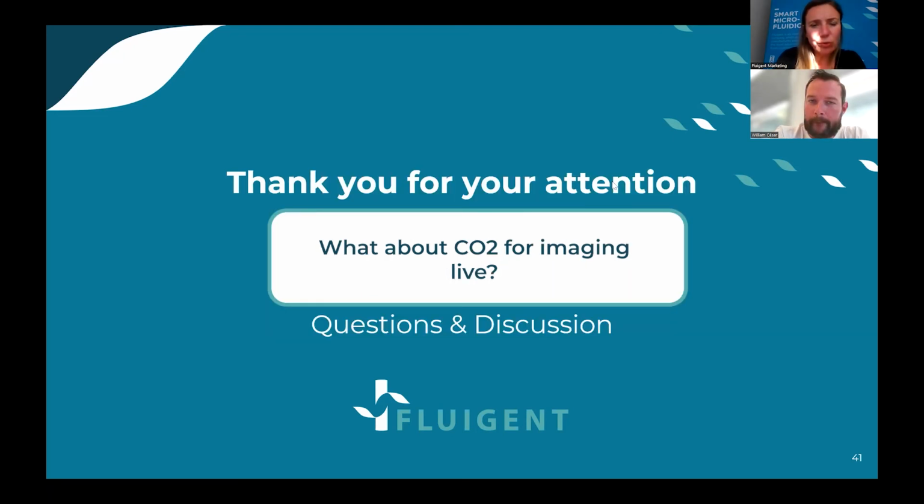What about CO2 for imaging live? William? Well, about the application, I don't know it. I cannot really. Yeah, well, I can maybe answer. If it is about mixing CO2 inside the solution, it is possible, as ARIA has a pressure input where you basically have to inject gas, and CO2 is compatible.